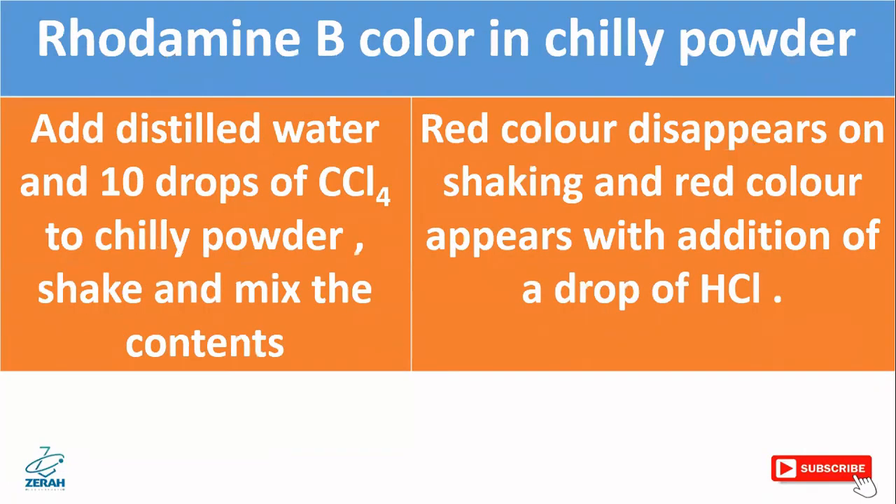There may also be rhodamine B color present in chili powder. Add distilled water and 10 drops of carbon tetrachloride to the chili powder and shake to mix the contents very well. The red color disappears on shaking, and red color that reappears with the addition of a drop of hydrochloric acid indicates the presence of rhodamine B color.